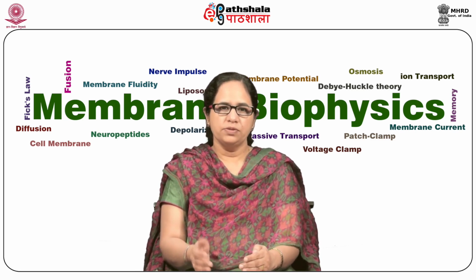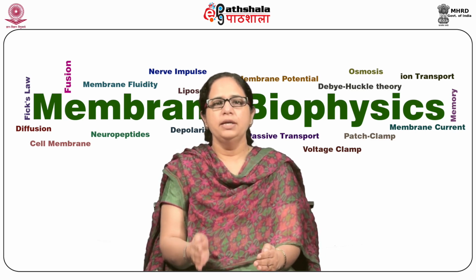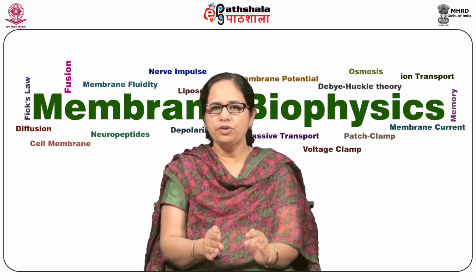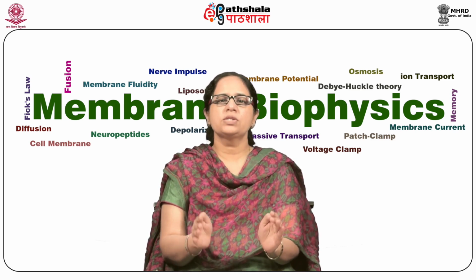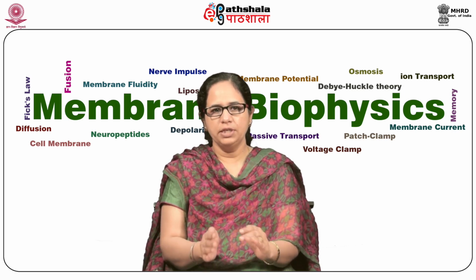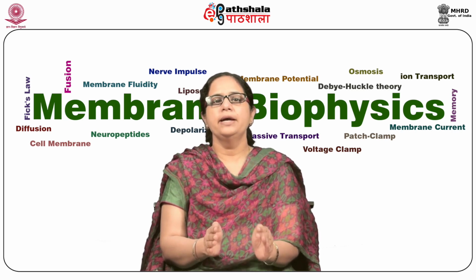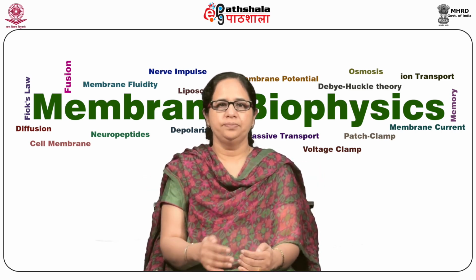The method was first developed by Cole in 1949 and then Hodgkin and Huxley in 1952 for use with the squid giant axons. Since then, many variants of the technique have been developed and voltage clamp analysis has been extended to a whole range of tissues.